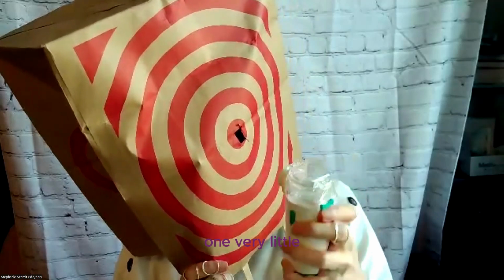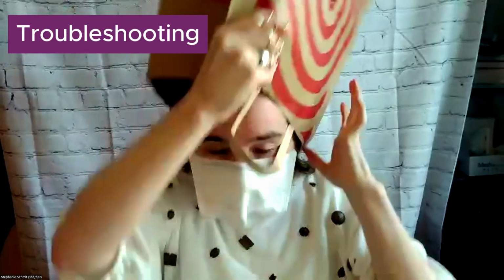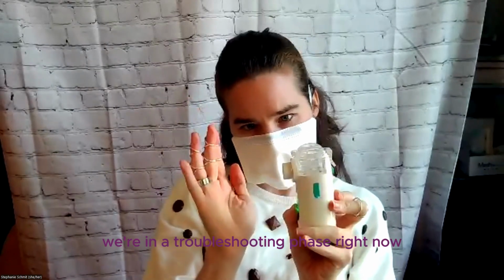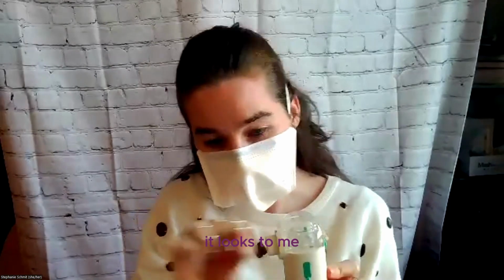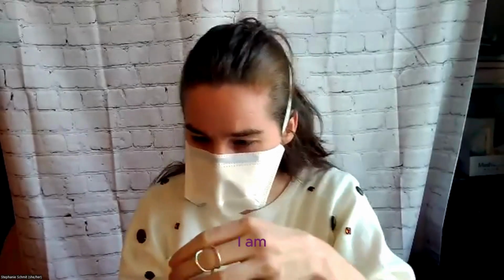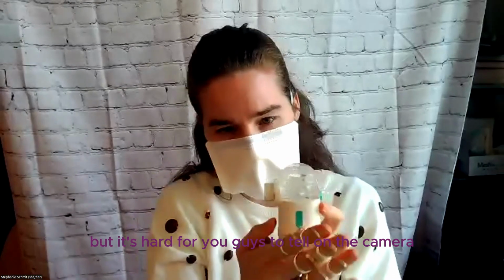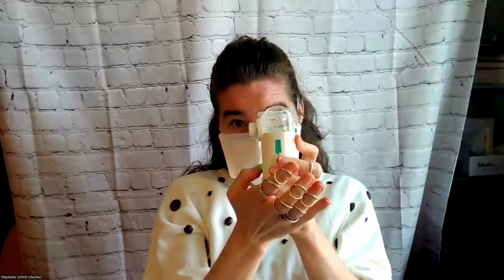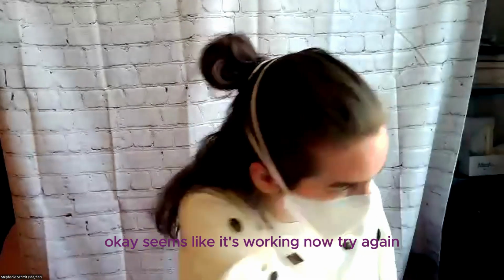One very little. I think it ran out of solution. Nope, it still has solution. Let's see what's going on. So I'm going to put my hand behind it so I can see if it's really, we're in a troubleshooting phase right now. Okay, so here's the troubleshooting phase. It looks to me like there's nothing coming out of the nebulizer. So I'm assuming it got clogged. But it's hard for you guys to tell on the camera. Okay, seems like it's working now. Try again.